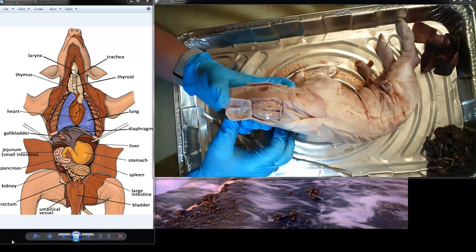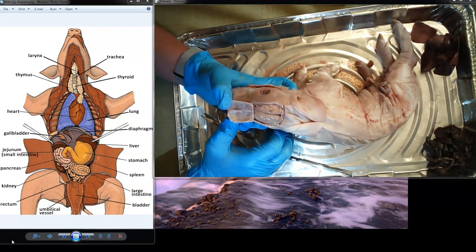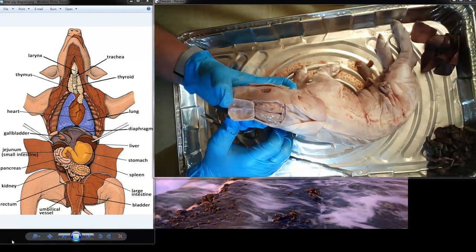Okay, I have a question. I hope it's a good one. Could I get a glove on and touch that brain? You want to get a glove on and touch the brain? Sure, we can do that off of camera. Okay.